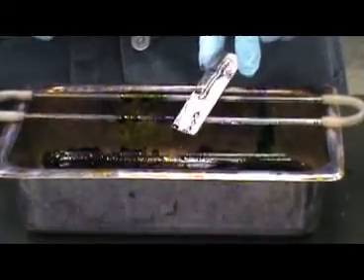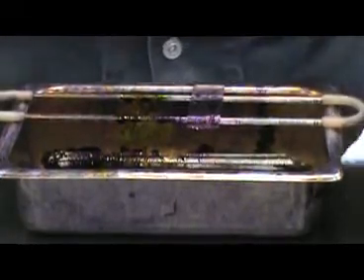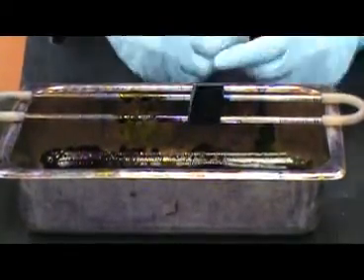When decolorizing, you want to run the acid alcohol over the slide until the alcohol running off of the slide becomes a very light or clear purple. Over-decolorization will cause the Mycobacterium to have too much of a blue color and be difficult to see. Too little decolorization will cause the Staphylococcus aureus to obtain a purple color, making it difficult to differentiate it from the actual Mycobacterium. After decolorization, do a quick water rinse and then apply your counterstain.